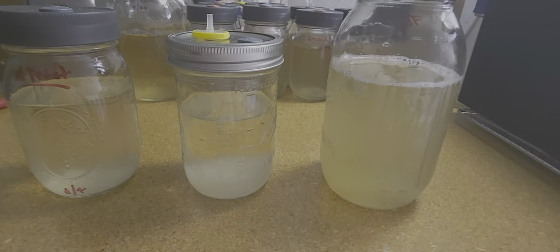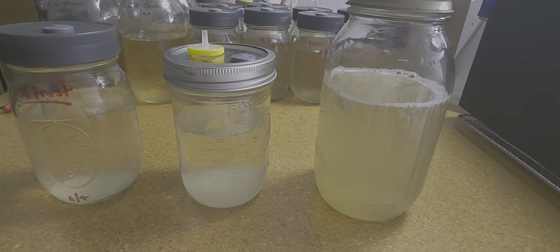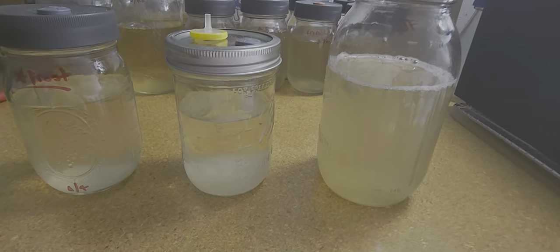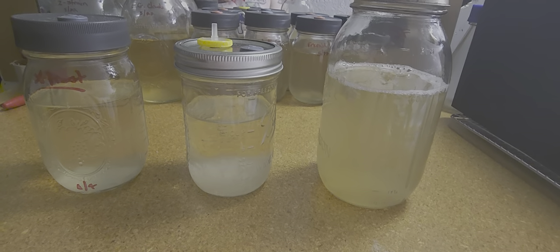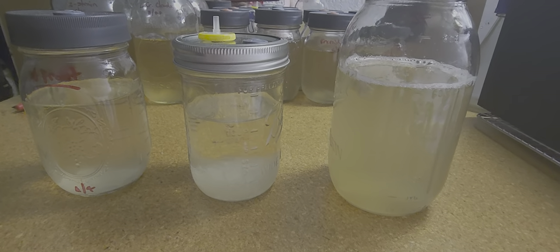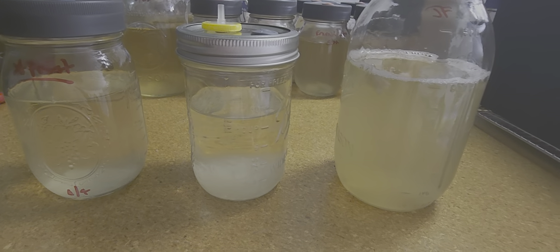Hey, what's going on guys. I wanted to make a quick video today — I am about to whip up some more LC broth. I wanted to show you an example of good indicators on if your LC is contaminated. A lot of people find it very, very hard to tell, but there are a few key indicators you can look for.